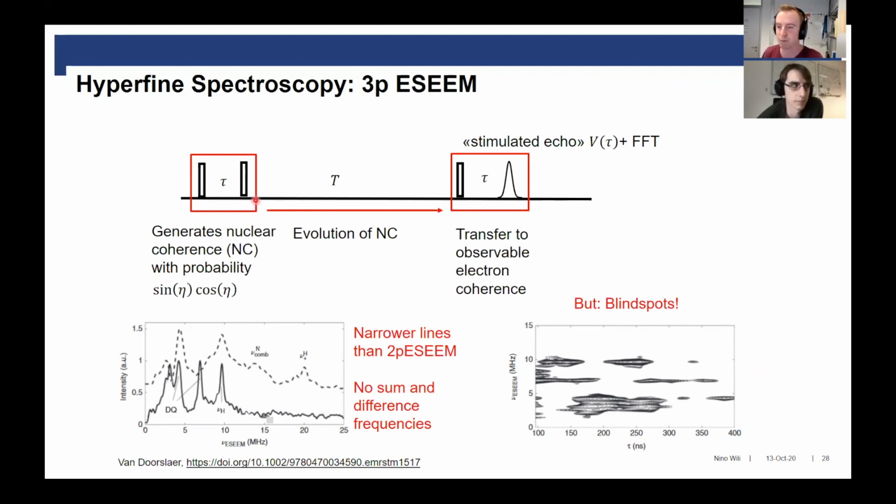But what is usually a problem in terms of resolution is that you have spectral diffusion between electron spins. Because here after this, not all your electron spins are in the same state. And then if you have other electrons present or something else happens in between here, also some exchange or whatever, this will also be an issue. But basically, if T1 relaxation is already an issue, if it's too fast, then you usually don't even see an echo. So that's why I think.